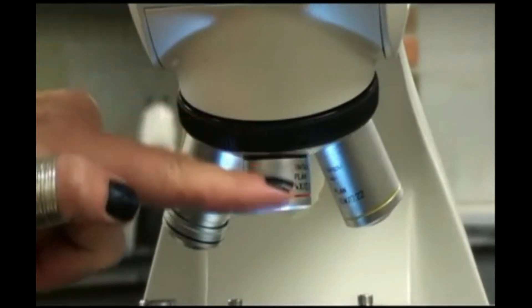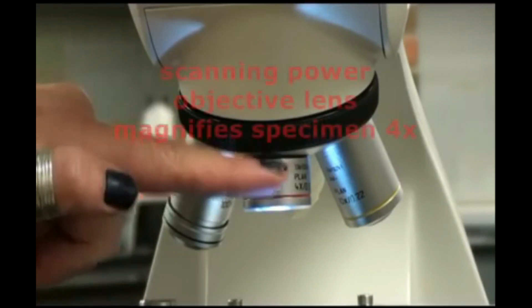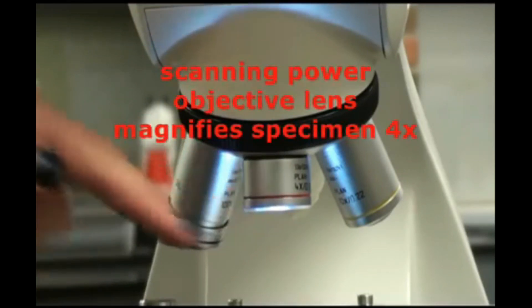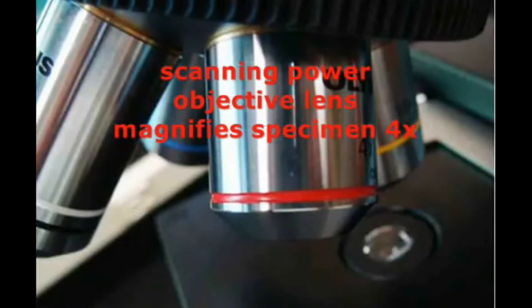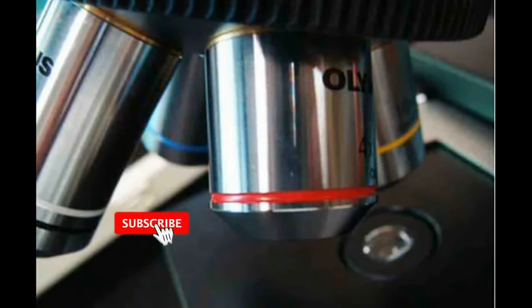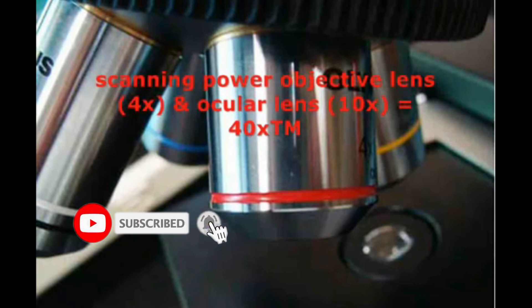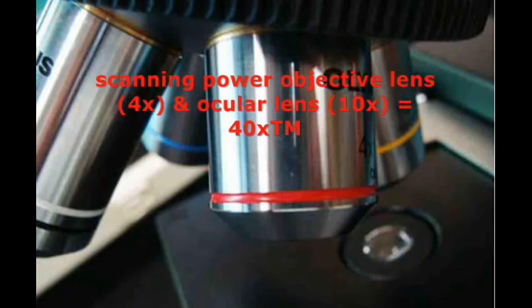The shortest objective lens is called the scanning power. It has a red band around it and it magnifies the specimen four times actual size. However, since I am always looking through both the ocular and the objective to view my specimen, I multiply the powers together to get my total magnification. So the ocular magnifies ten times, the scanning magnifies four times, meaning at scanning power my total magnification is forty times actual size.